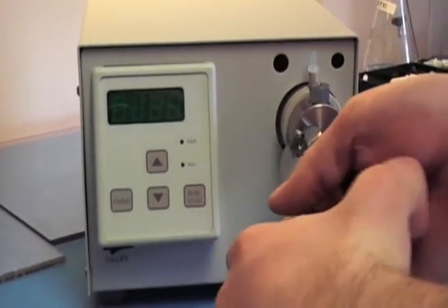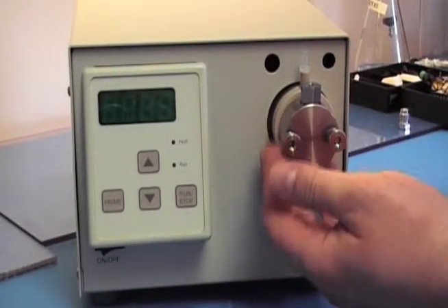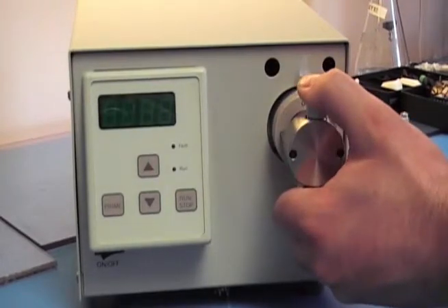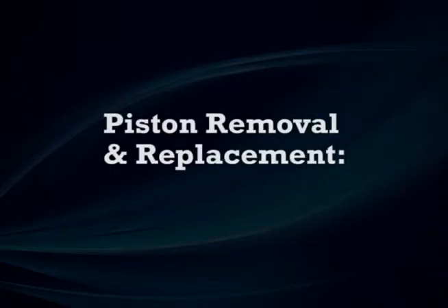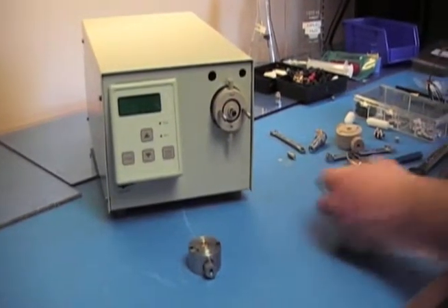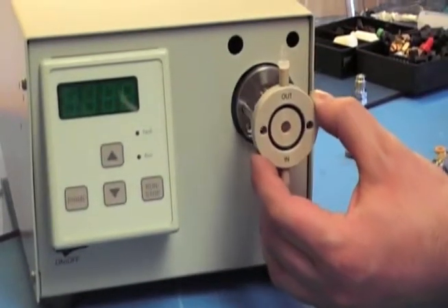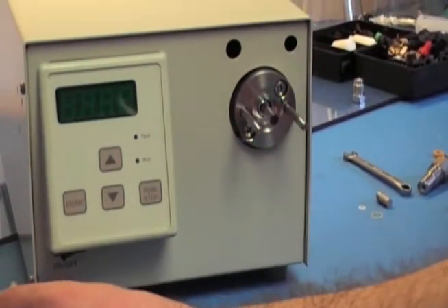Loosen up your thumb nuts. Screw them the rest of the way with your fingers and just pull it off. After you remove the head, remove the backup washer. Remove the self flush.